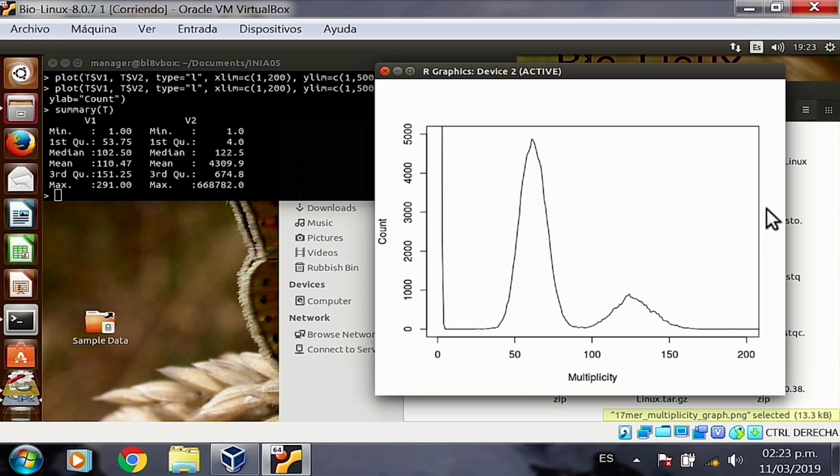So then we see that there is a huge drop from 1, and it stays low until we start reaching around 50. Or in some of your cases, it will be around 500, or even after 500, perhaps 600. What it's telling us is that from that point forward, more and more Kmers are counted this many times. So for example, here, how many Kmers are counted 50 times? We just do a vertical line here, and around 1,000 different Kmers were counted 50 times.